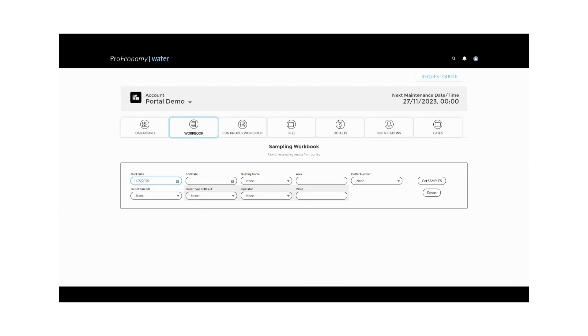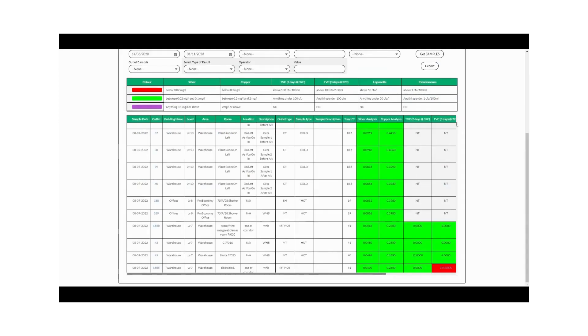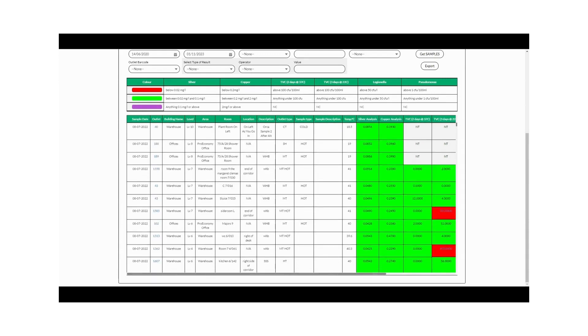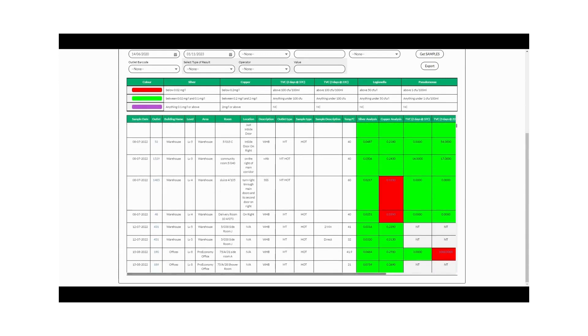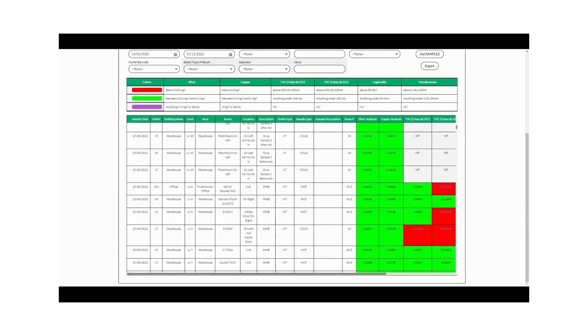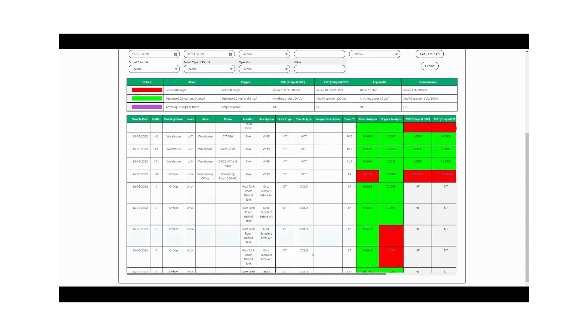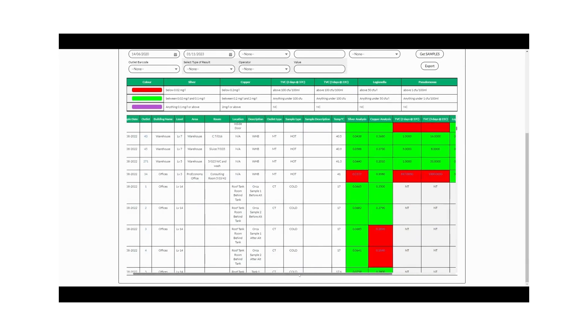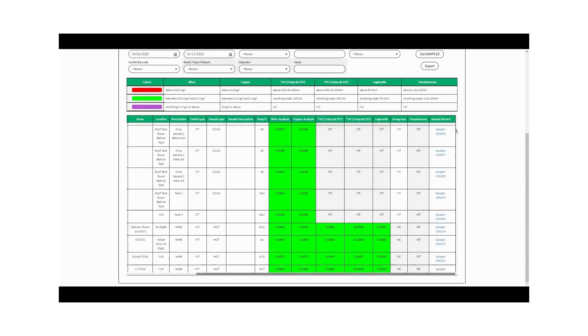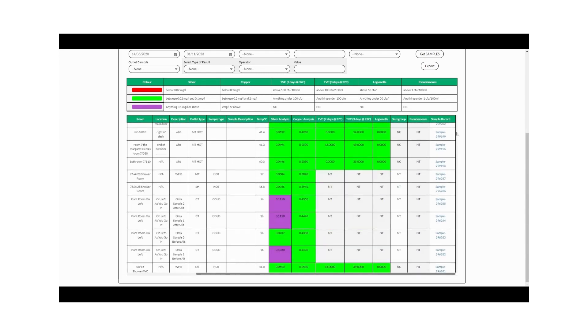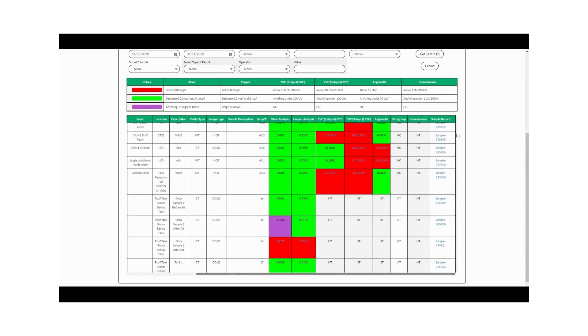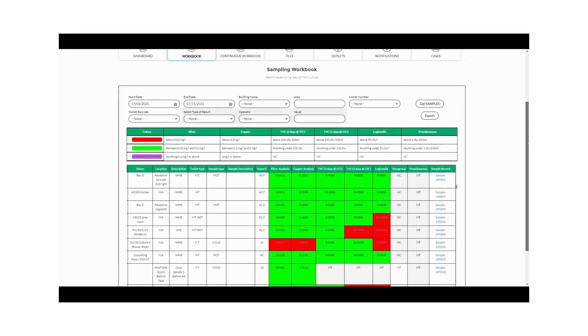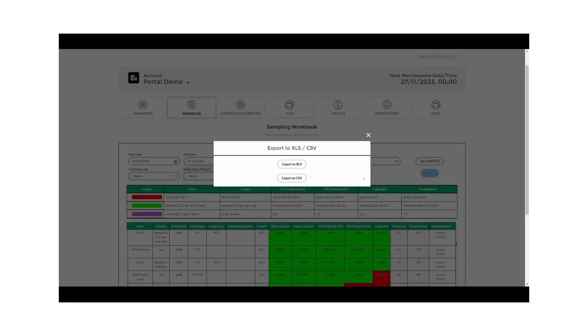Now, let's explore the workbook. This is where you can input dates and review the results of the water samples you've collected. The workbook is your central hub for managing water sample data. You can input specific dates, access results, and maintain a continuous record of your water quality.